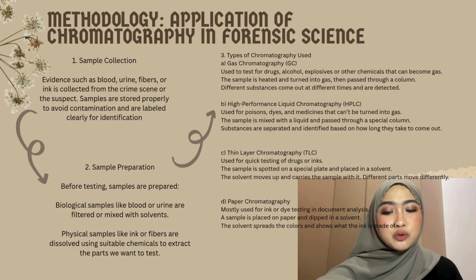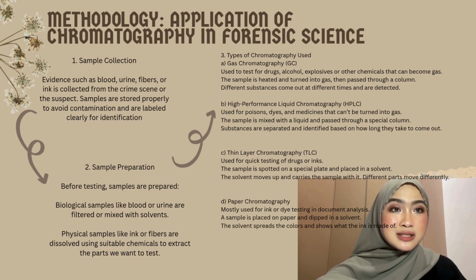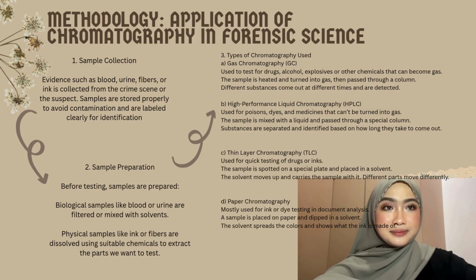The sample is pushed through a column filled with a liquid. Different substances travel at different speeds, allowing us to separate and identify them.